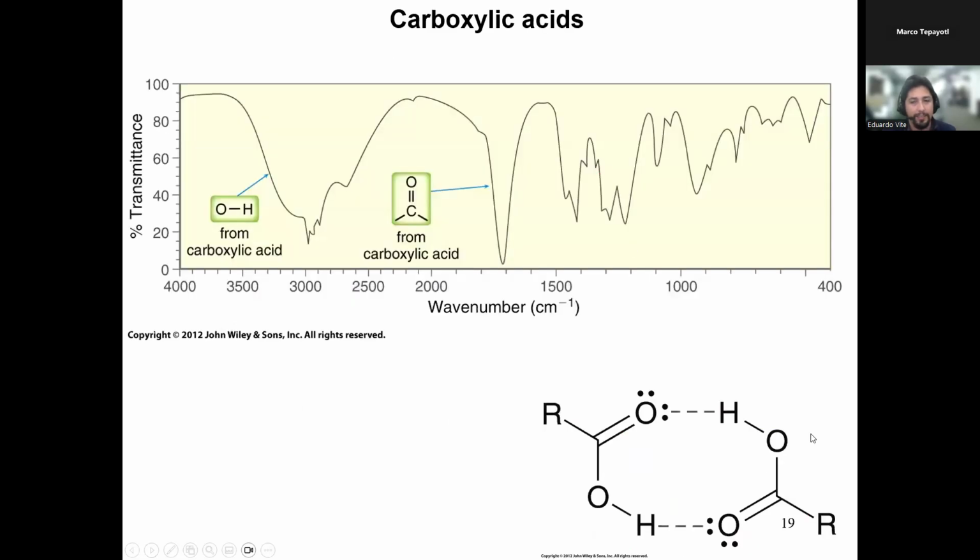And then a little bit on the family of alcohols is the carboxylic acid. The carboxylic acid is COOH, so it does contain an alcohol. So you still see the broadening of the signal. You see over here, starting at around 2500, the signal gets very broad and it doesn't stop until about 3500 in the wave number. So if you see a signal that is extremely broad like this, and also you see at 3000 the CH3 stretching, the stalagmites I was talking about, when you combine these two, it almost looks like a beard.